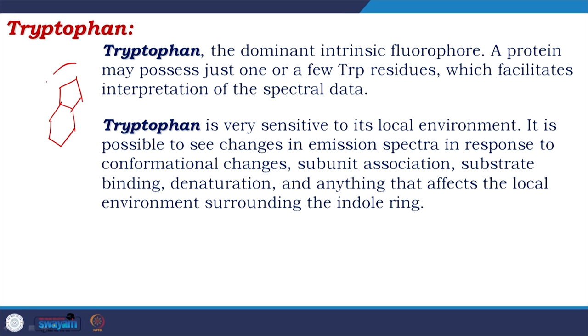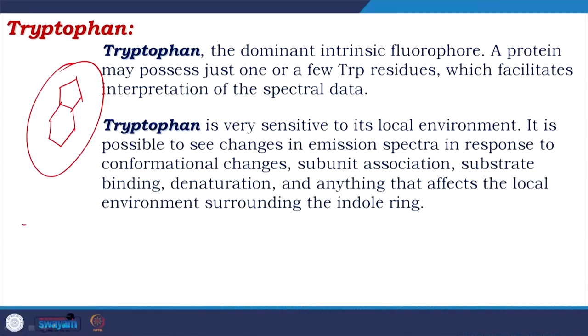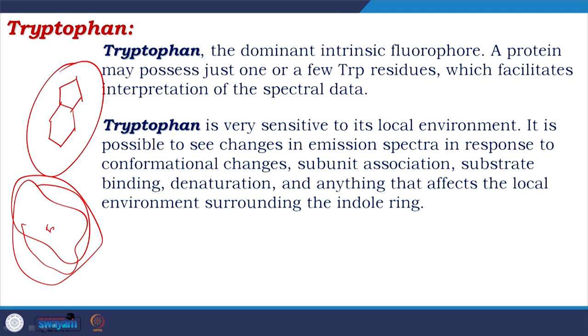This is the tryptophan moiety, right? Now, why is tryptophan so important? Suppose this tryptophan is present inside the hydrophobic core of the protein. Now, when you add some heat, thermal energy, or change the pH, or add some denaturing agent, what will happen? For most soluble proteins, you will see the possible opening. Now, when the protein starts opening, tryptophan would be more exposed to water, so there would be a continuous shifting.